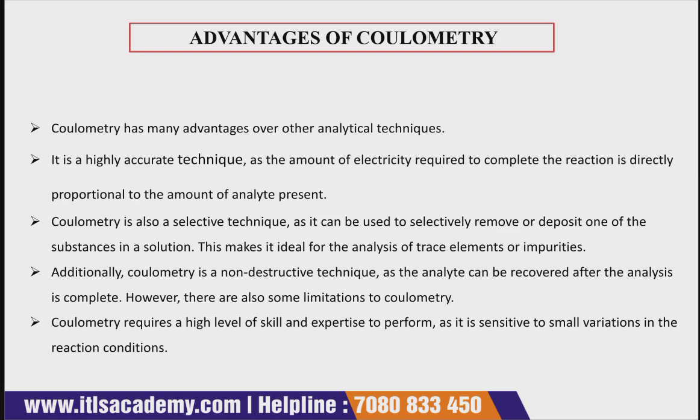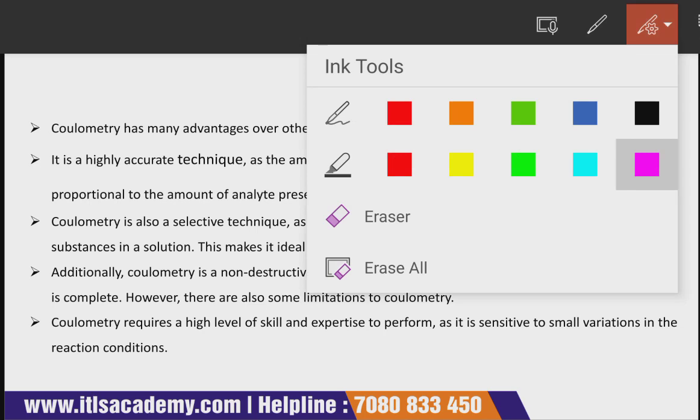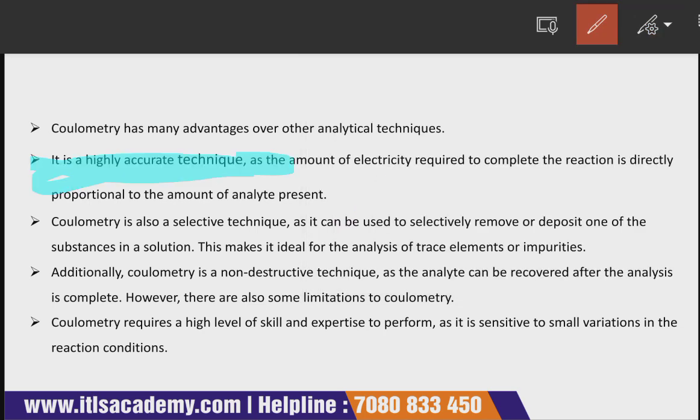Because of this high accuracy, it has more usage compared to other analytical techniques. The amount of electricity required to complete a reaction is directly proportional to the amount of analyte present. So the first advantage is that it is highly accurate.